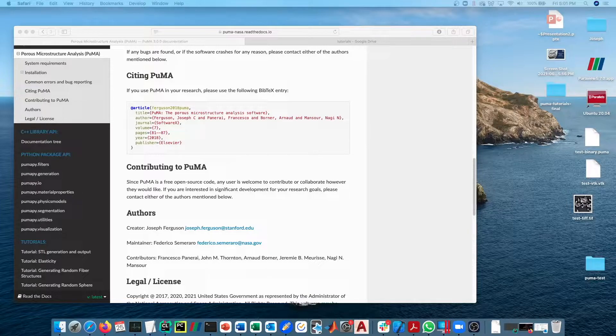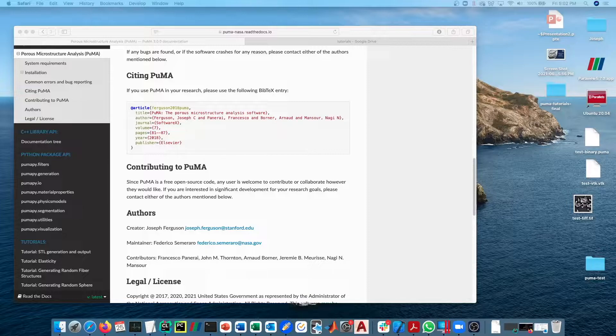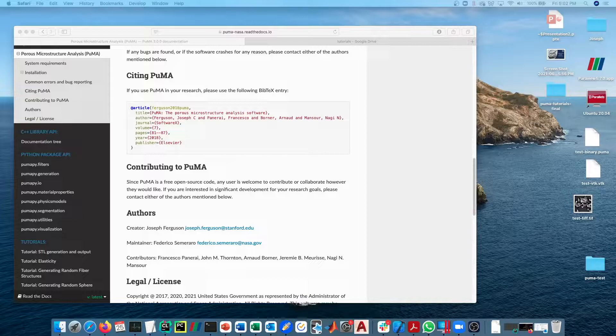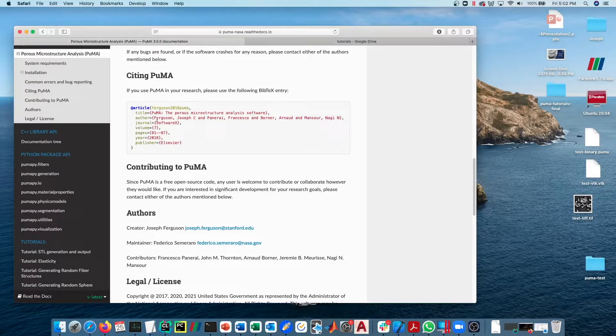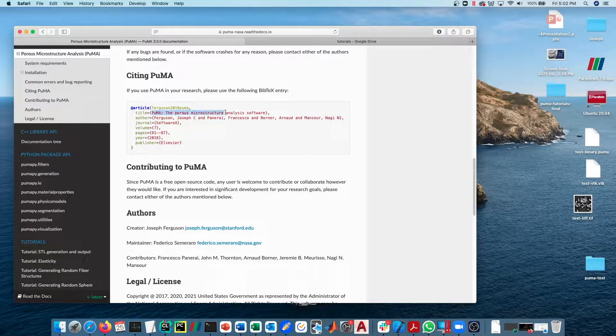The rarefied tortuosity is a bit beyond the scope of what can be well explained in a tutorial video like this. It's explained a little bit in the Software X paper that we published, which you can see here on the screen: PUMA, the Porous Microstructure Analysis software.